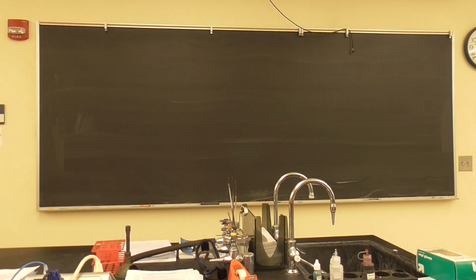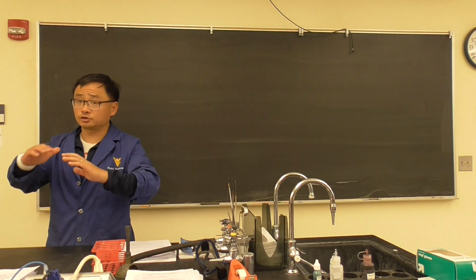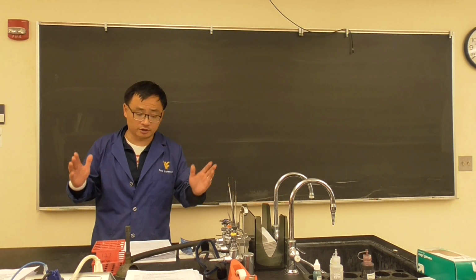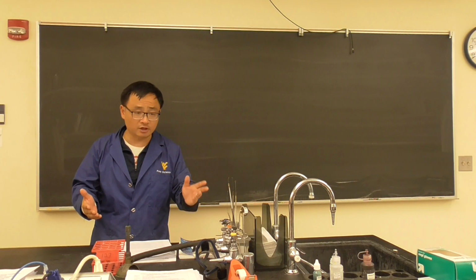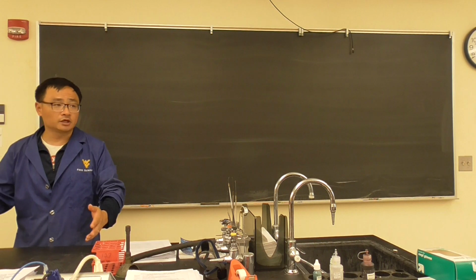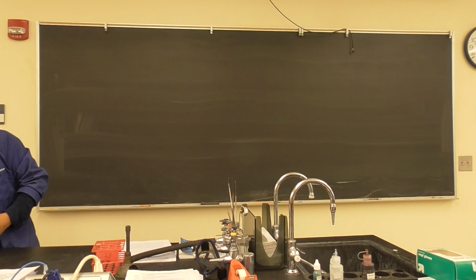It's much better than the case where you don't have any large ones and you have to count all those smaller ones. If it's evenly distributed, you could split the plate into 4 parts, count one, and multiply by 4, because pour plating is basically an estimation. You won't get an exact number. The reason why people do that is because it saves one day of time to make the media. Otherwise, you need to spend an extra day to make the media, let it dry, cool down, and solidify, then go ahead to do the spread plating. That saves energy and time, okay?